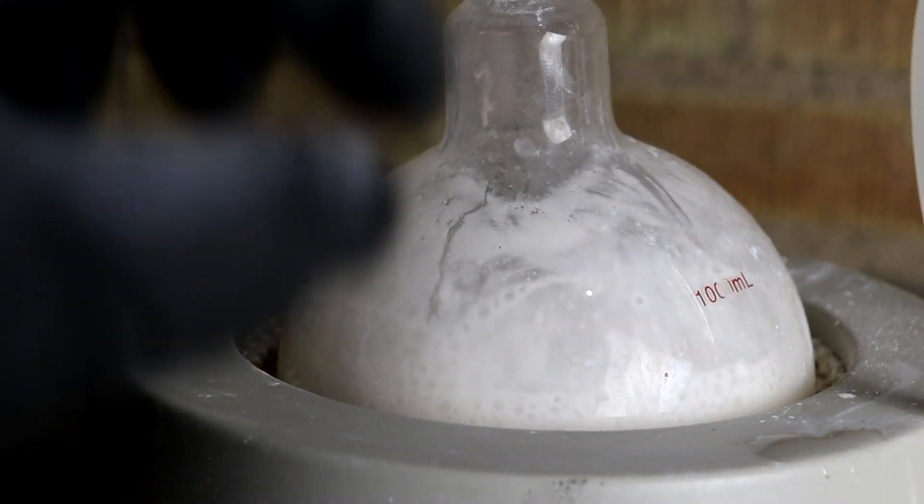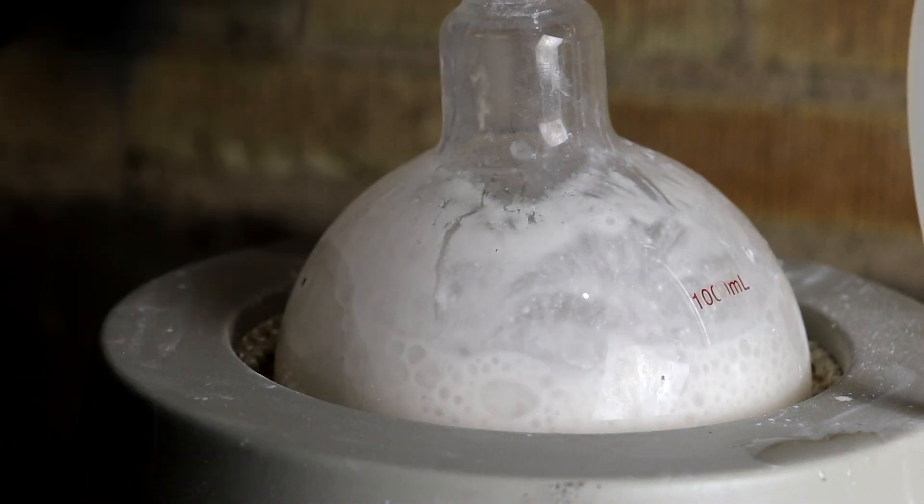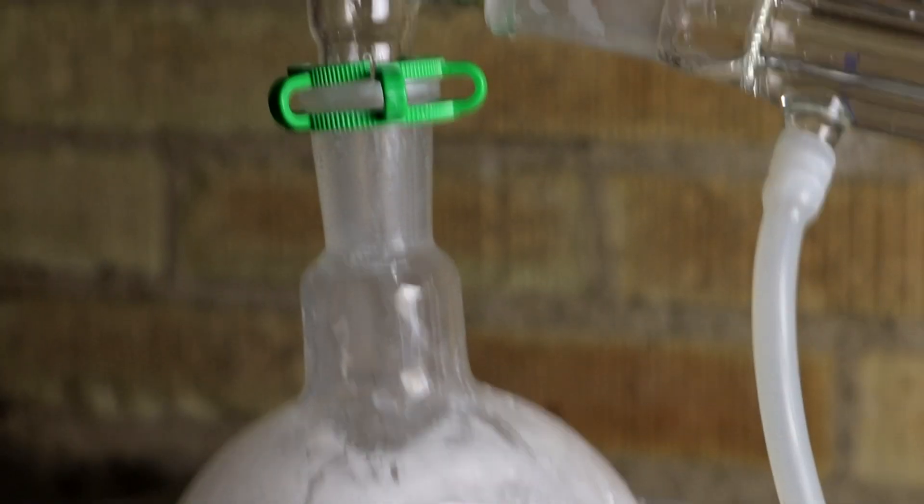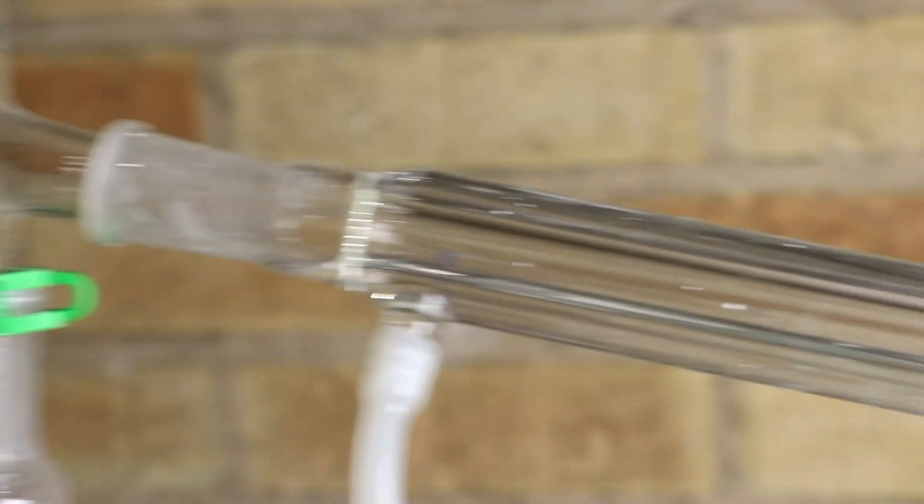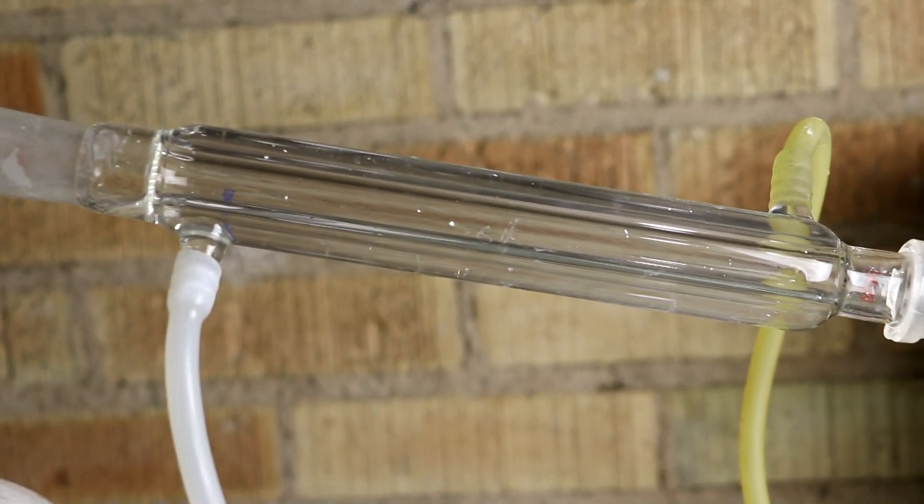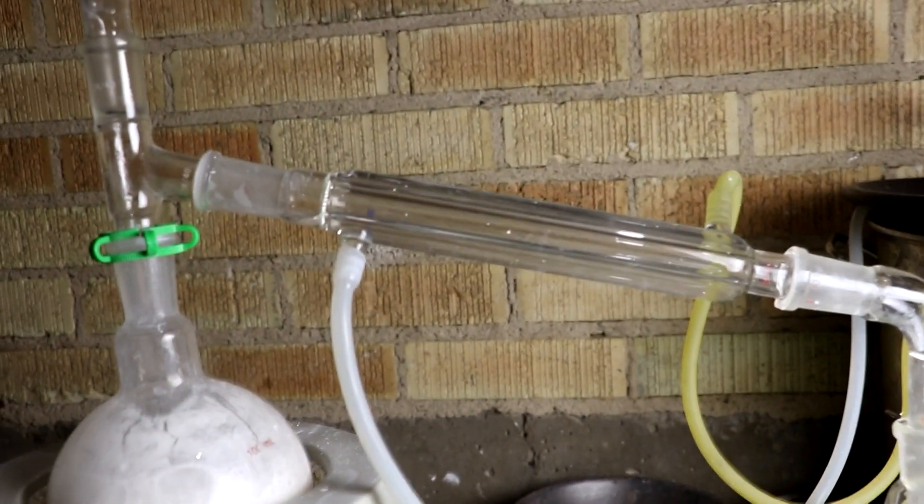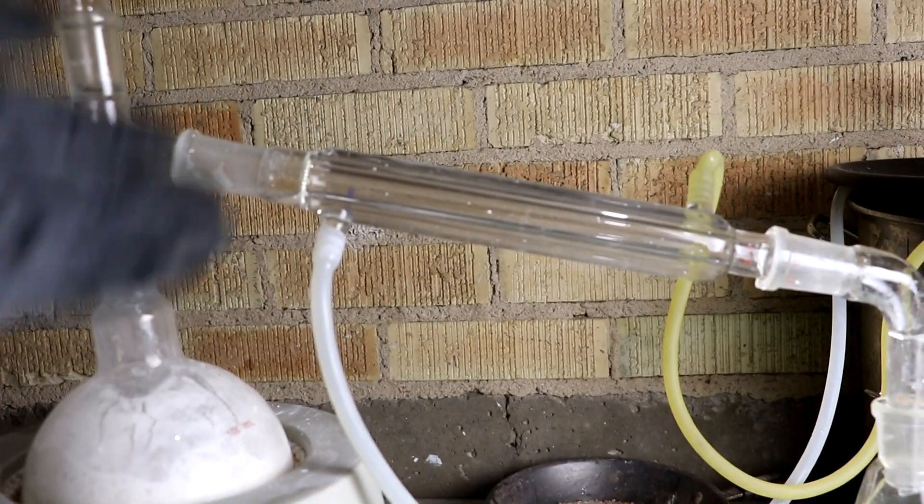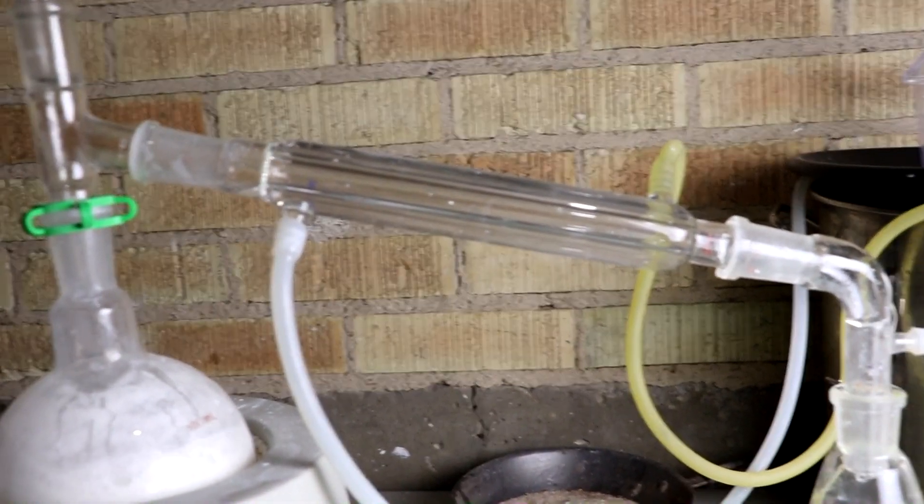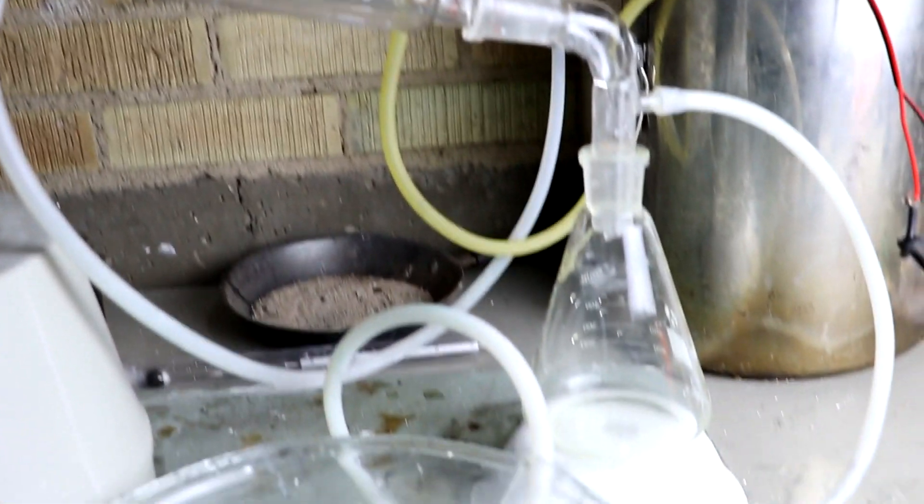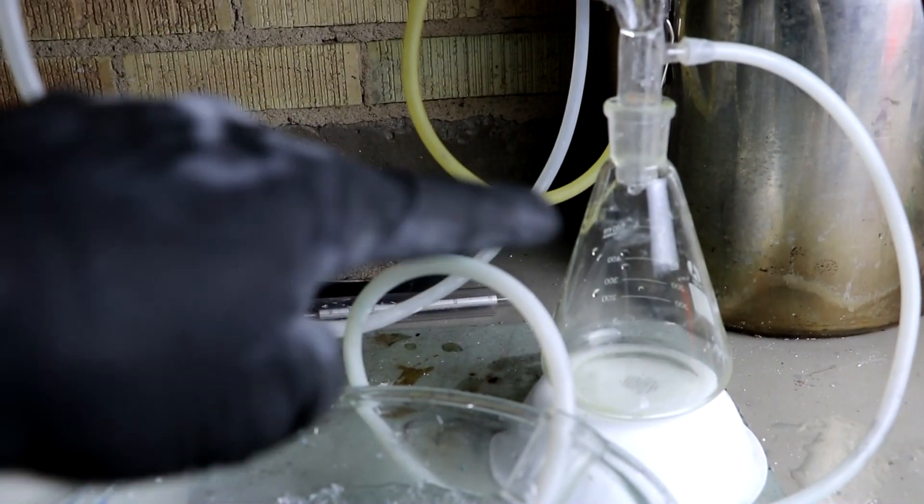As the solution heats up, the ammonia boils out along with some water vapor. So up here I have a condenser with some cold water running through it where the water vapor is condensing and probably absorbing most of the ammonia. That ammonium hydroxide solution then drips down into this flask here.